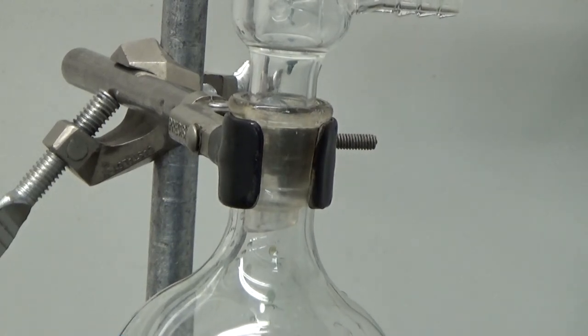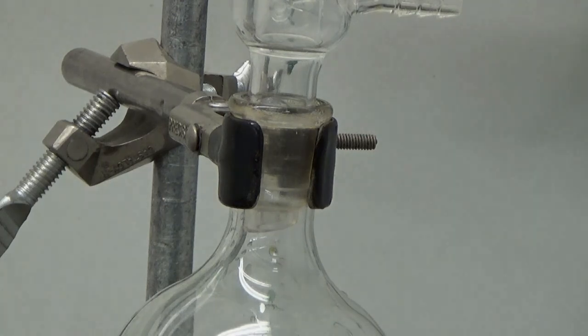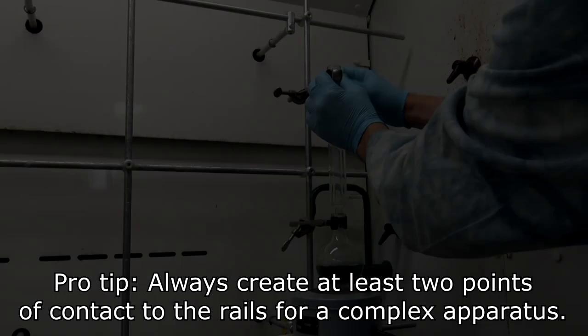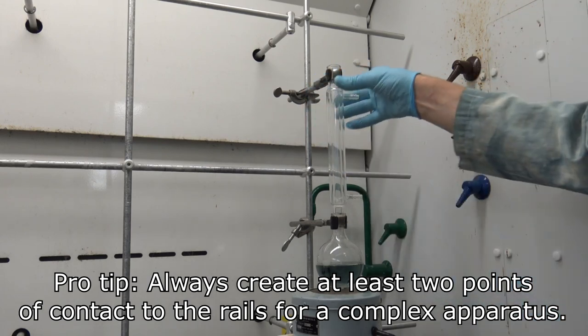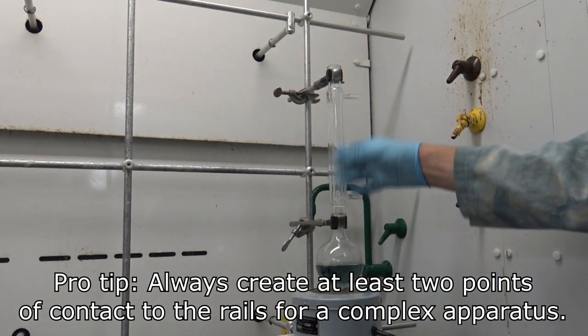At this point, if you choose, you can use your blue keck clip to clip this joint to further secure it, but we're going to use a clamp on the condenser instead. Finally, I'll clamp that Liebig condenser in place to be sure that my apparatus is stable.